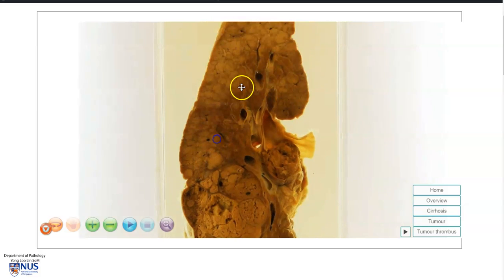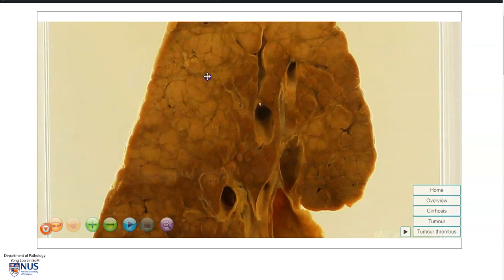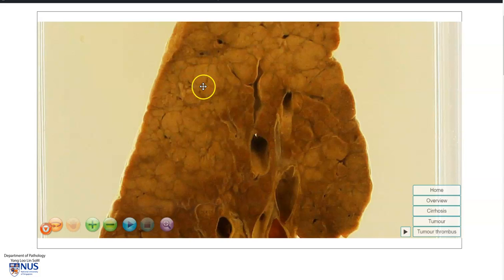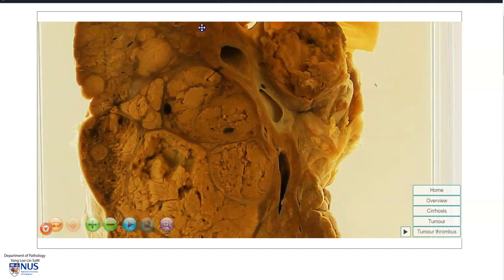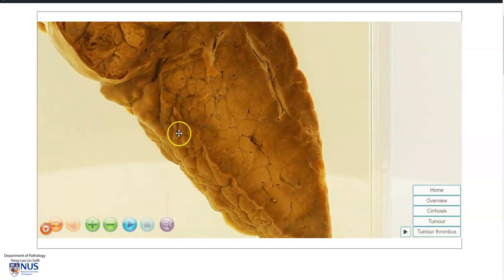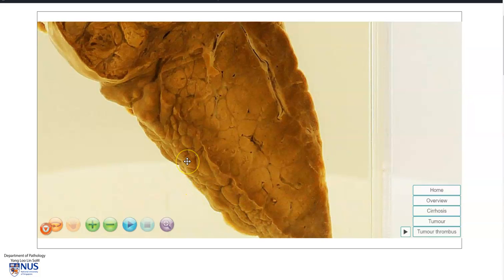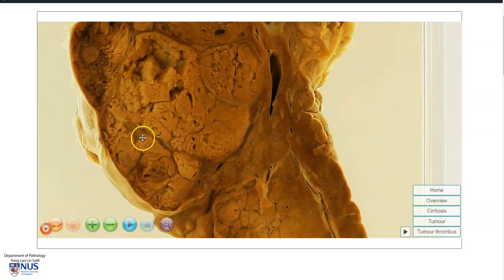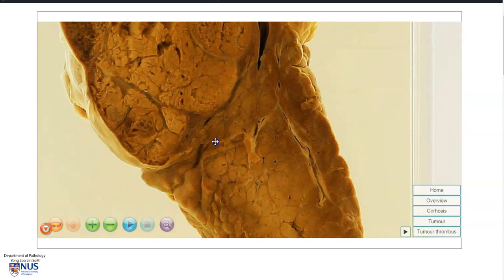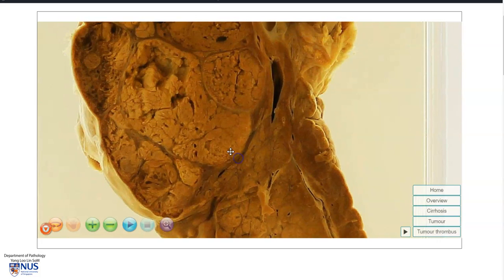If we look in the liver parenchyma, we can see that it is composed of numerous nodules of varying sizes. In this region, we can see that the nodules impart a very irregular nodular surface to the liver capsule, and this is indicative of cirrhosis. The tumor itself appears a lot more fleshy and larger, and hence is distinct from the background cirrhotic nodules.